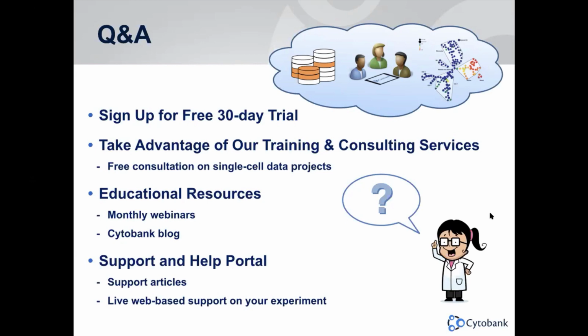Got it. I do have another, probably that will be our last question due to the time. So I have a question asking, is there a minimum number of events per sample that a Citrus analysis can be performed? Example, minimum 100 events per sample in a group of 20 individuals. Anna, do you have any insight on that, or otherwise I can take that one?